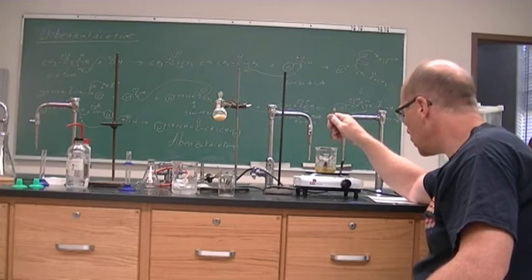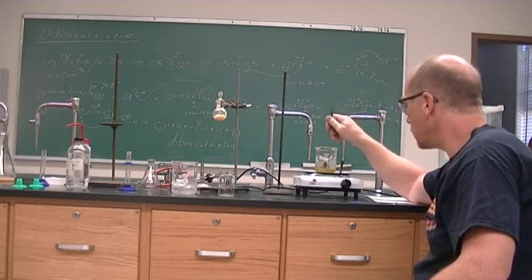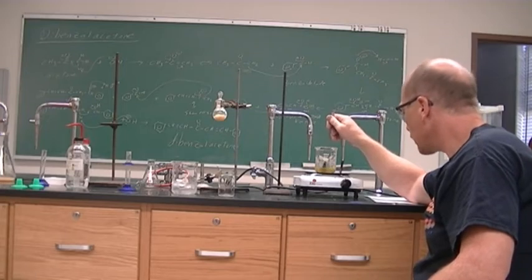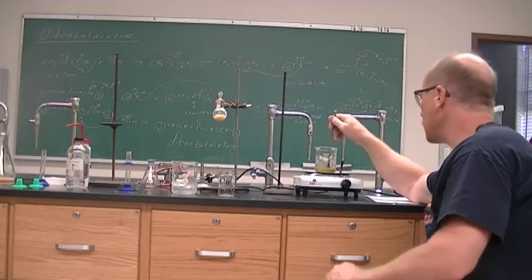Alright, now most of the solid has dissolved, not all of it. It has not all dissolved.